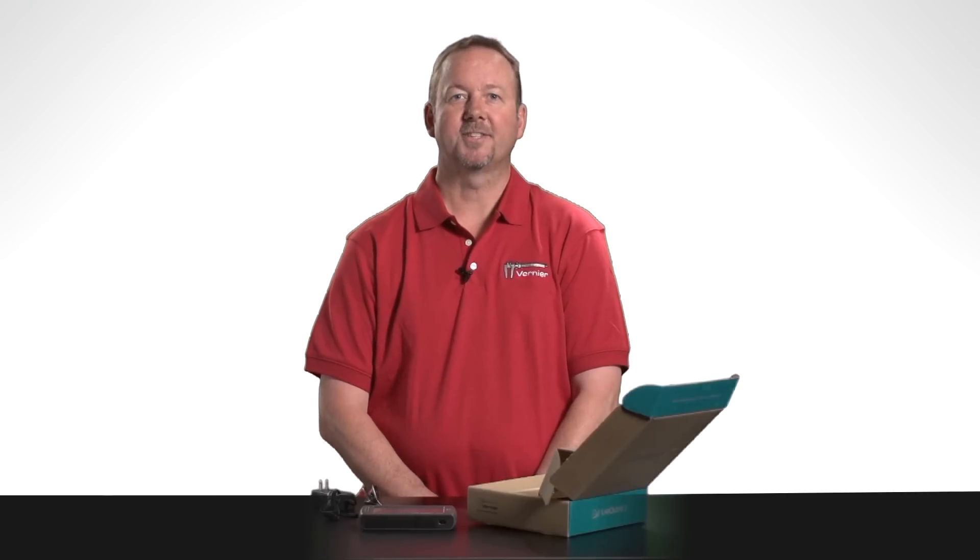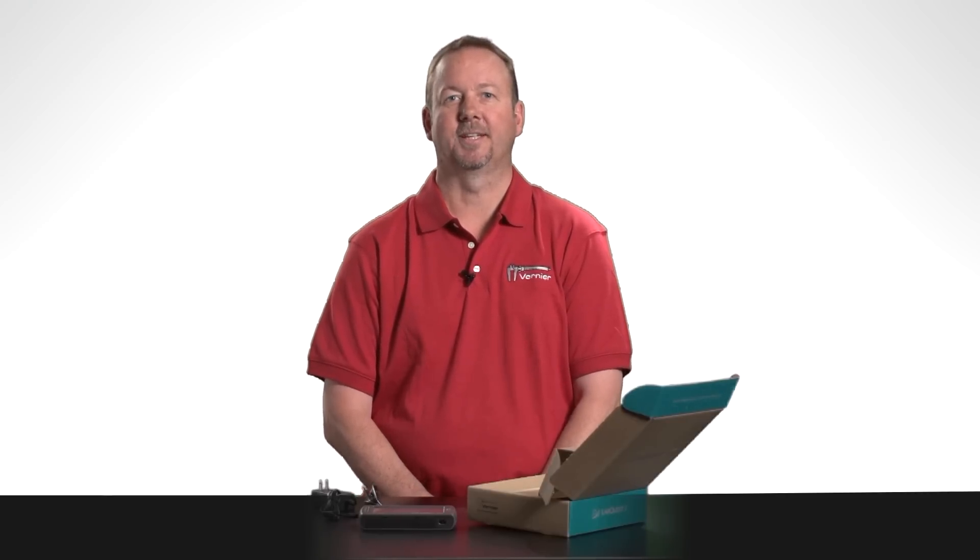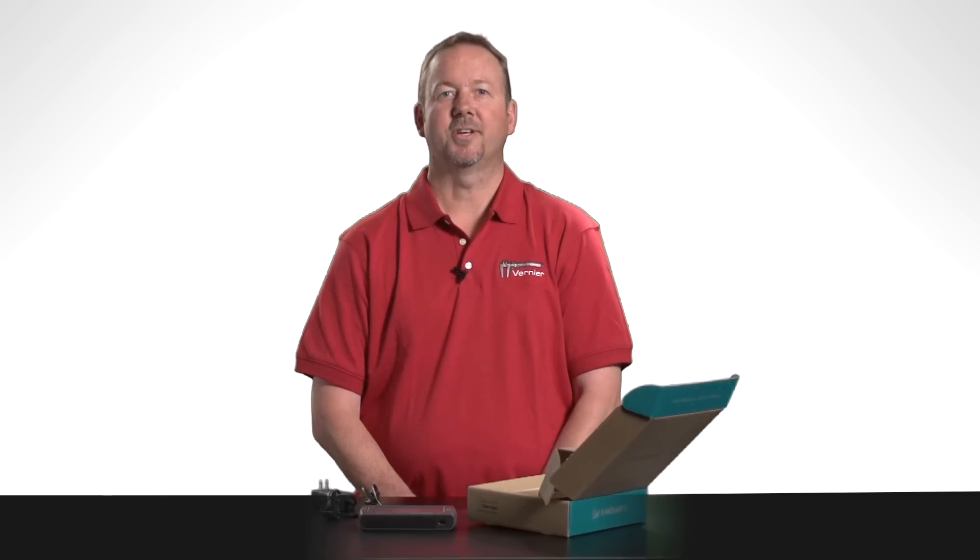Now anytime you're ready to plug in a sensor and start using LabQuest and explore its many capabilities. If you want more information, you can download our full user manual from our website.